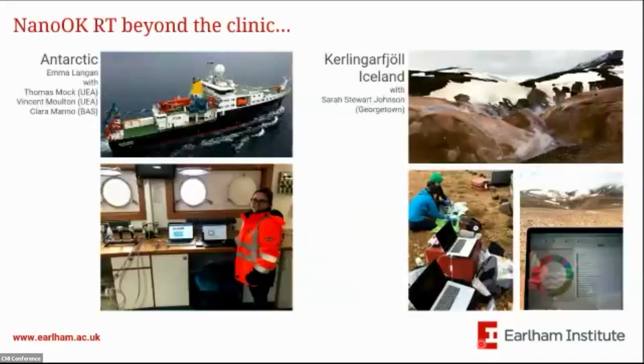So the potential for these kinds of nanopore approaches for rapid diagnostics and for real-time analysis, we think we've shown. And we started to see that this tool that was developed for a very specific application had uses beyond that application. One of the key things about it is that it didn't require any kind of internet access. The Oxford Nanopore solution at the time required reads to be uploaded to a cloud service. And the fact that we could run it locally, actually just on a laptop if necessary, meant that we started to see these other uses.